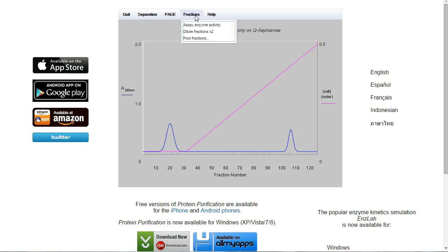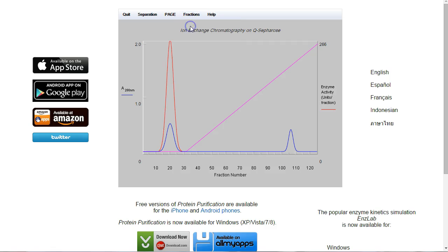If we want to double-check that, we can go to fractions, and we can try enzymatic activity. And there we go. The activity is in that peak there.